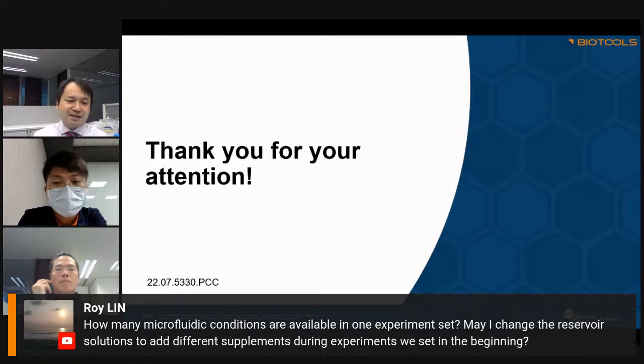In this case, we will say it is not a good idea to do so because you will lose monitoring of what you are doing. Most of the measurement is already set at the beginning of the experiment, so I don't see that we should make any changes to the reservoir.